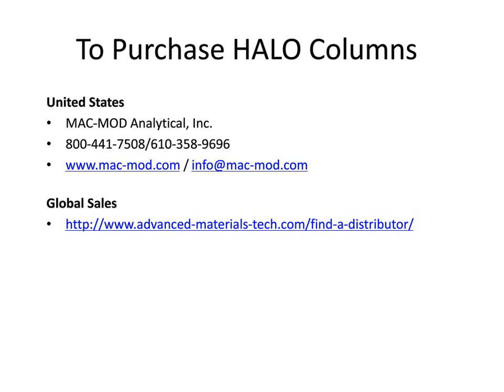All right. Next question. You described the use of some unique acids in the presentation. Where can these be obtained? Oh, okay. Well, they're actually commercially available through Sigma Scientific, as well as a company called Fluorochem, which is located in Florida, and I think you can pull that off a Google search. But I know that Sigma has them as well. We've compared them, and they look highly comparable in terms of their quality and cost.